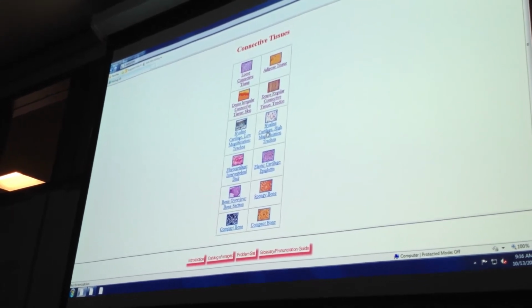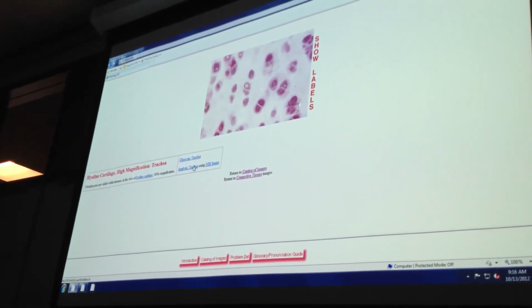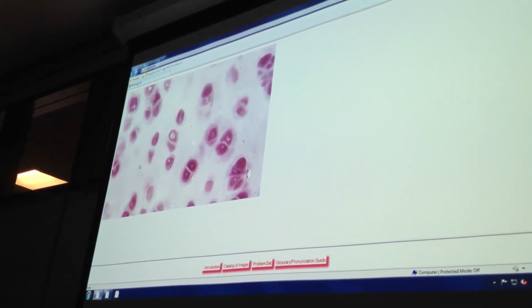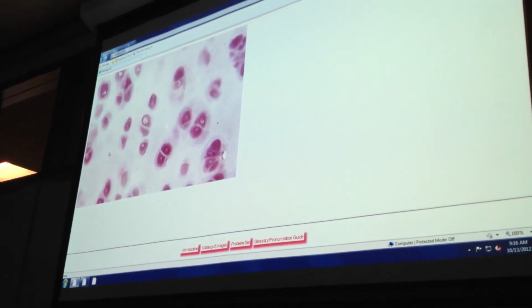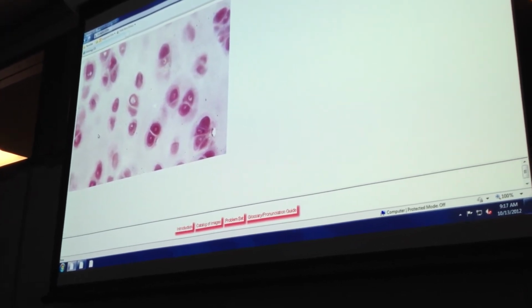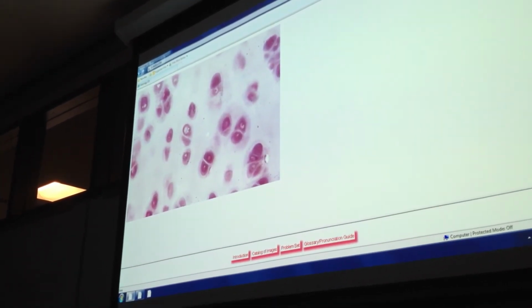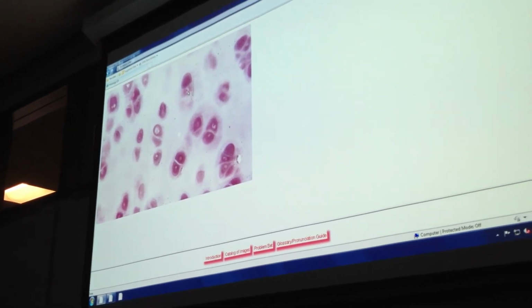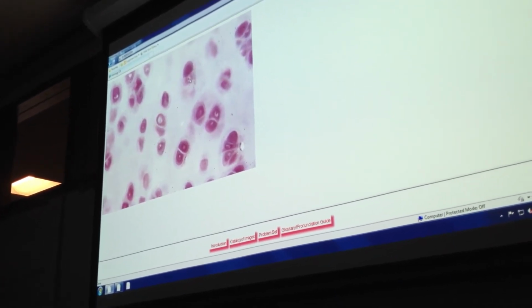Okay, we're going to go here first. Okay, what's the non-living matrix? Chondroitin. Now remember, this is hyaline cartilage, which means it's kind of clear. What's the opening? Lacuna. What's the cell that we find inside of it? Chondrocyte. This is on the trachea.